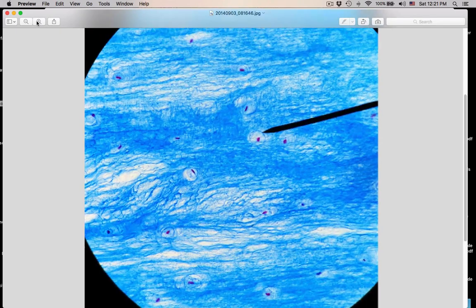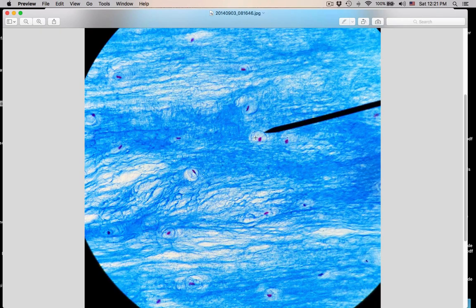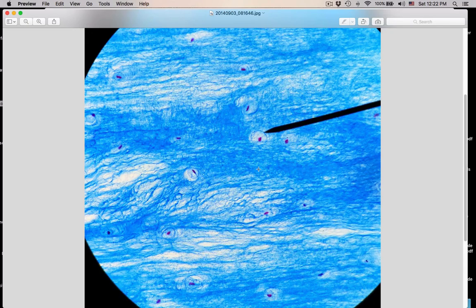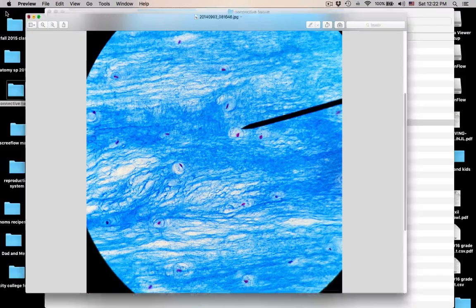Here you see a lacuna with the chondrocyte nucleus stained bright pink. But look at that matrix — it is filled with collagen fibers. You know it's cartilage because of the lacuna. This is fibrocartilage, one word. The strongest cartilage. It withstands compressive forces and is found in the intervertebral discs, the pubic symphysis holding the two pubic bones together, and the menisci of the knee.